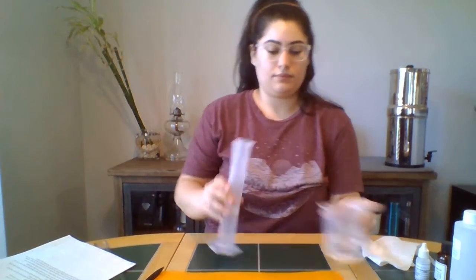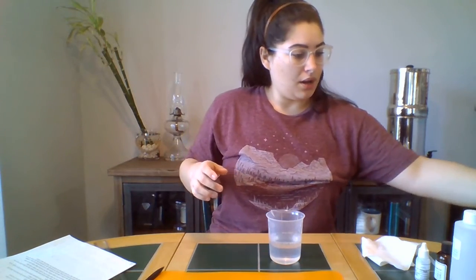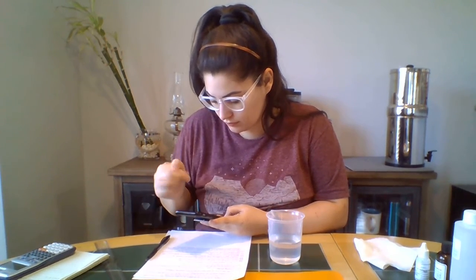All right. Okay, so now, oh, just put them in. Okay. Right. But then I'm going to put a timer on my phone. It says let the blocks rest in the vinegar for 7 minutes. It says gently place. Alright, so I guess what is that?